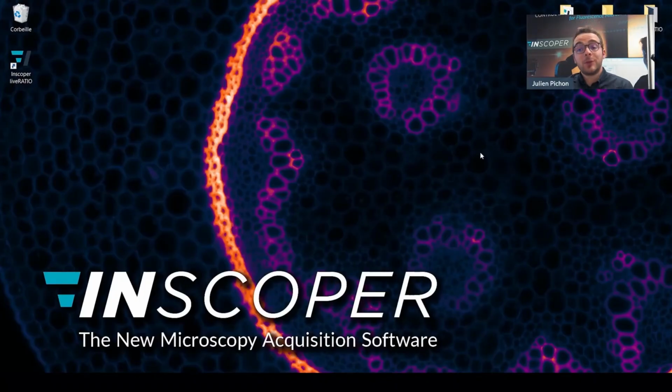So now let's move to the online demonstration. I'm very happy today to present to you the experiments we performed with the INSCOPER liveRATIO and the new light source from coolLED. This new light source is dedicated to ratiometric imaging and is named the pE-800 fura.